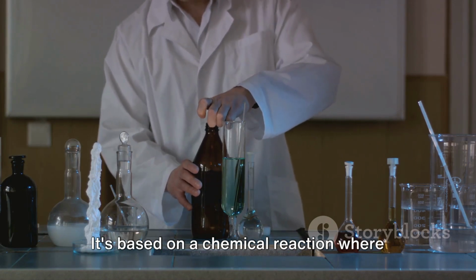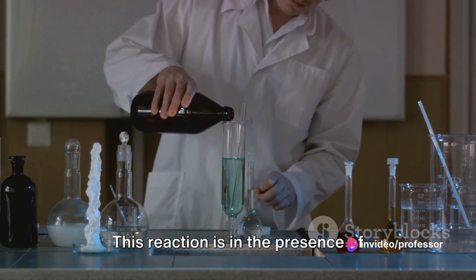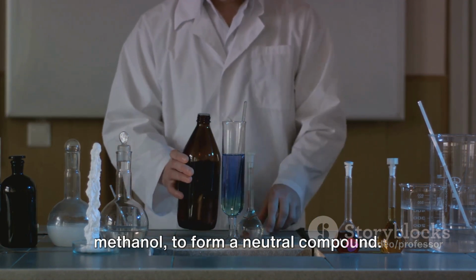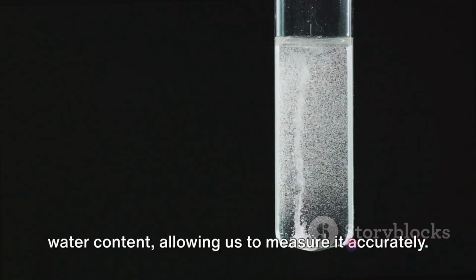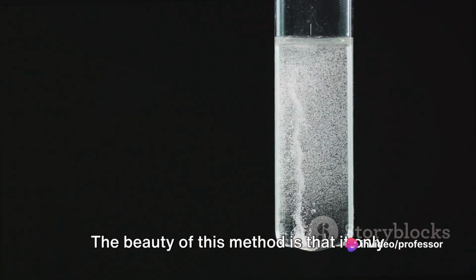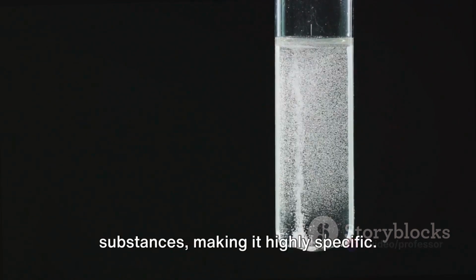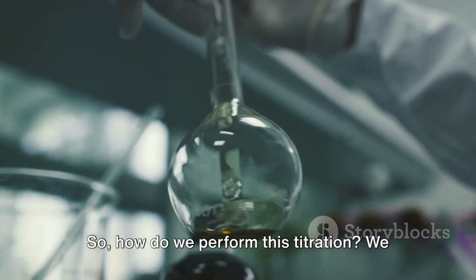It's based on a chemical reaction where iodine reacts with water. This reaction is in the presence of sulfur dioxide and an alcohol, usually methanol, to form a neutral compound. The amount of iodine consumed in this reaction is directly proportional to the water content, allowing us to measure it accurately. The beauty of this method is that it only reacts with water and not with other substances, making it highly specific. So, how do we perform this titration?